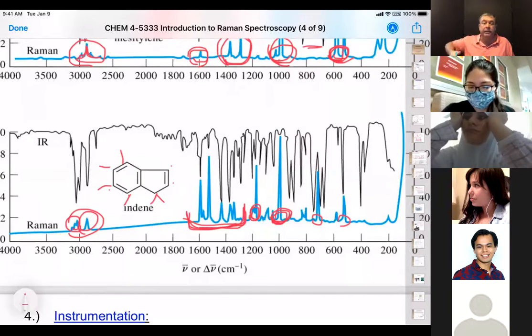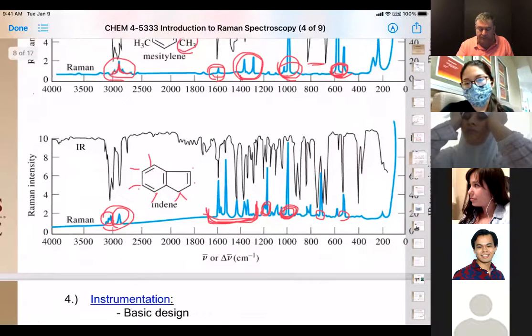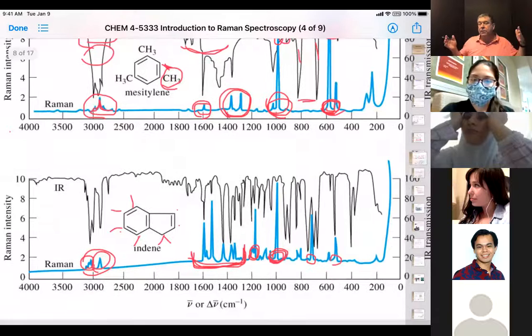They even have handheld devices. You just stick it in a bag and you can get a Raman spectrum and then compare it to your library. And you can see if your bag of grain is contaminated because the Raman spectra will change that much by having something there that should not be there. Okay, questions on how to use and the concept of how Raman spectroscopy works?